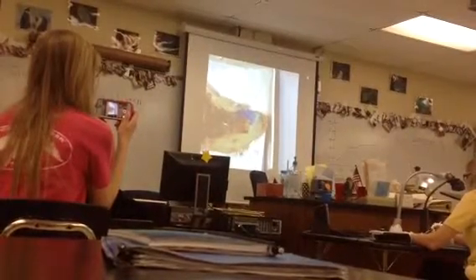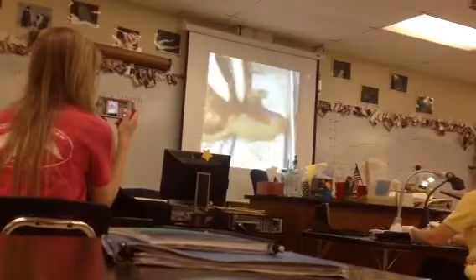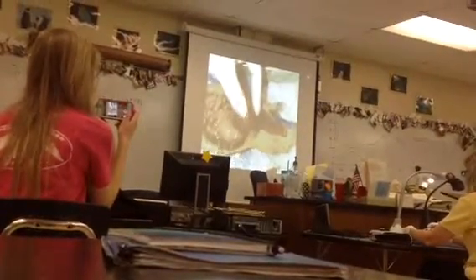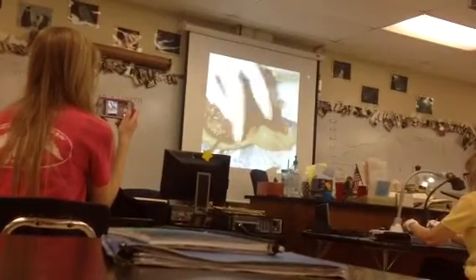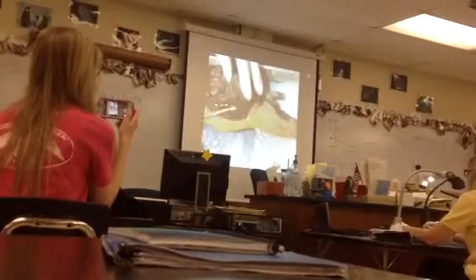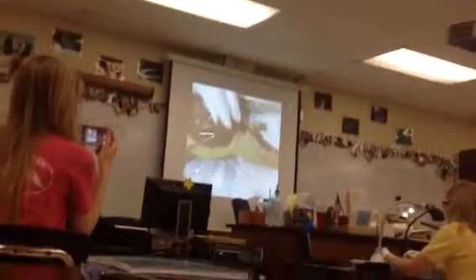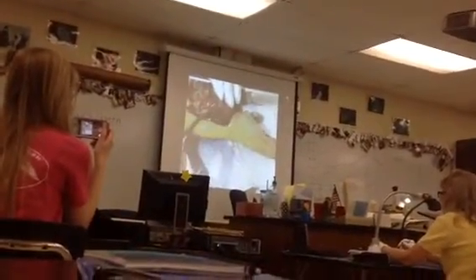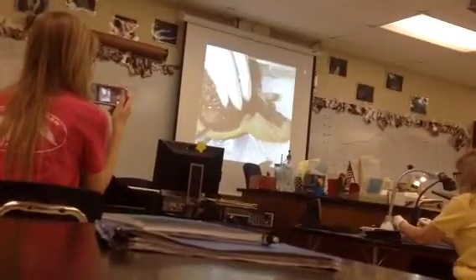And then there's a flap of the diaphragm, this is all the liver, and then look at how big this stomach is. So this one had a lot to eat right before it died. Its last meal was huge. Then underneath the stomach, we have the spleen. It's this finger-like looking thing right here. And then hanging underneath the spleen, all this gunky looking stuff is the pancreas.